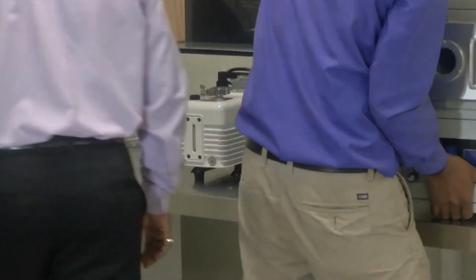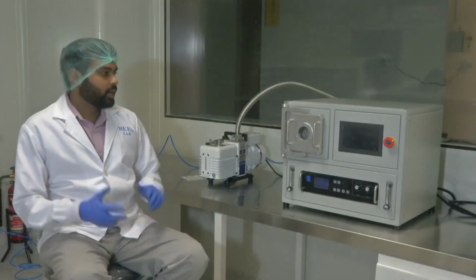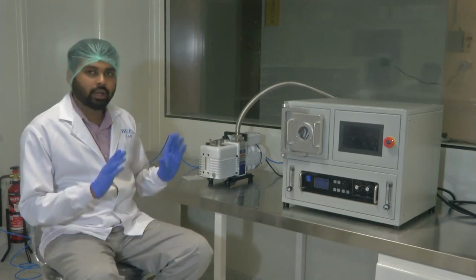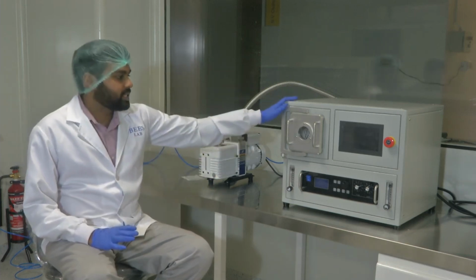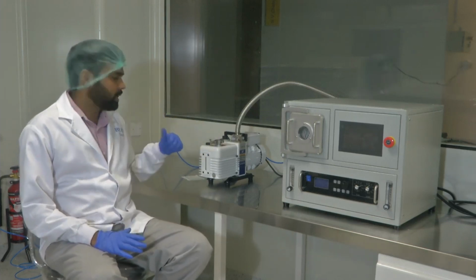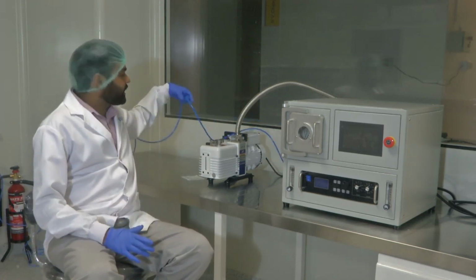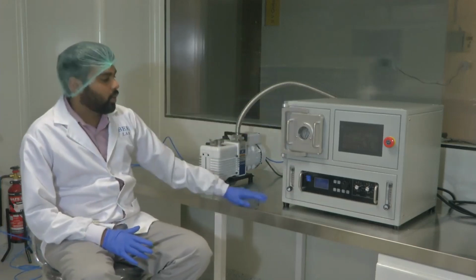So this is an oil based vacuum system. There are oil-less vacuum systems also. As you have seen, we were trying to assemble the system. We have now assembled the plasma bonder system, and this is the main unit. This is the vacuum pump, and we have the oxygen cylinder behind me. The blue tube that you can see here is the oxygen supply that is connected to the backside of the main unit.